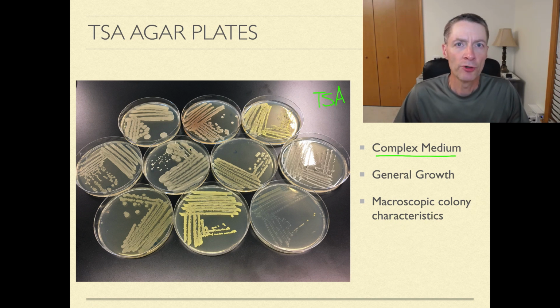Now, if we were to take some further steps to look at what these organisms do metabolically, what enzymes they contain that allow them to function, we wouldn't want to forge ahead with a mixed culture. We want a pure culture. So just looking at these various plates in front of us, I would immediately say we need a little more work with this plate that I X'd out in green, because I see two different species here.